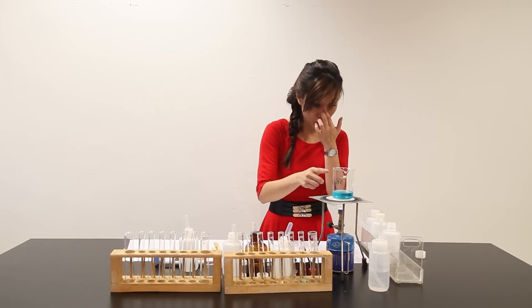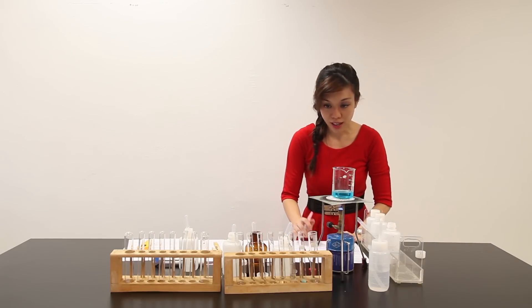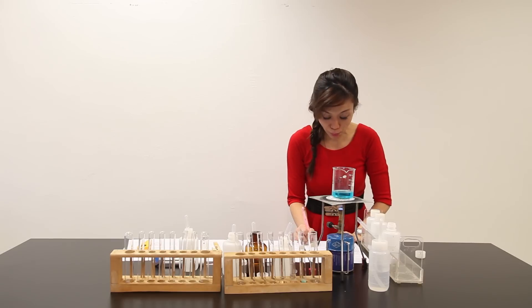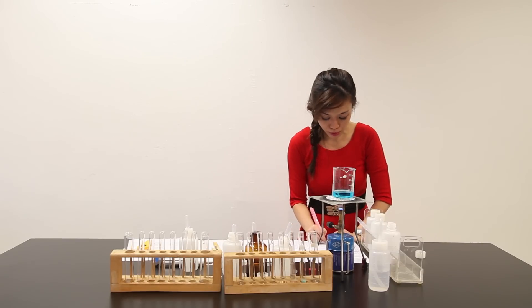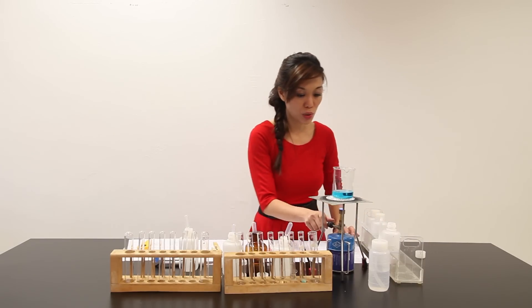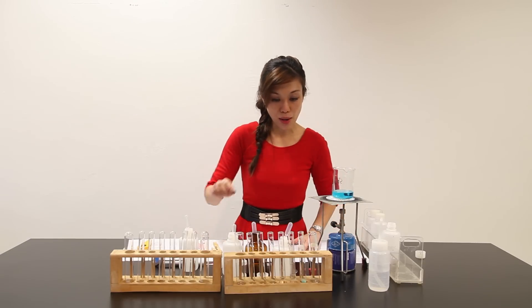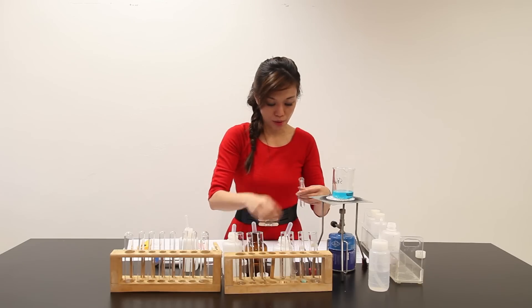I already have the solution — I just need to warm it. Let me write down the observation: upon adding acid Y to the solid from Part A, the black solid dissolved giving a clear light blue solution. I should not allow it to boil. This is my solution Z.